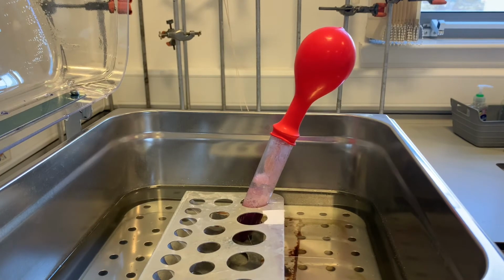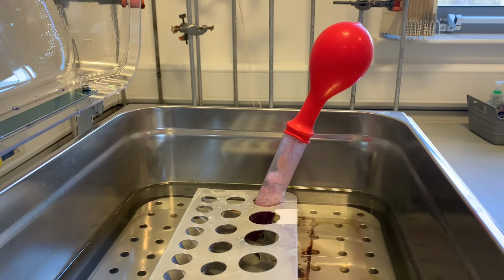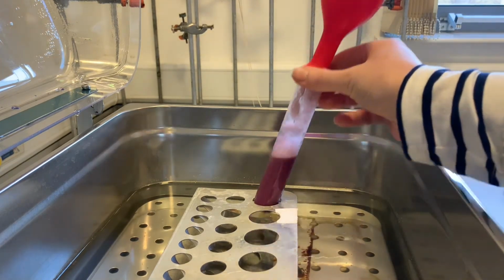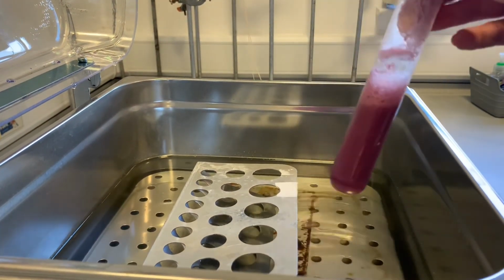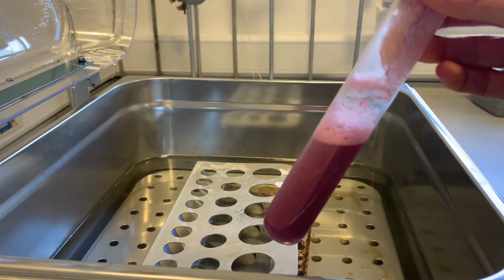So because the yeast have been feeding on the sugar in the grape juice in the absence of oxygen, they've been carrying out the process of fermentation, which has obviously produced the carbon dioxide gas, which we can see being collected in the balloon. But the other thing that will also have been produced is alcohol. And what we can do is take the balloon off and have a sniff.